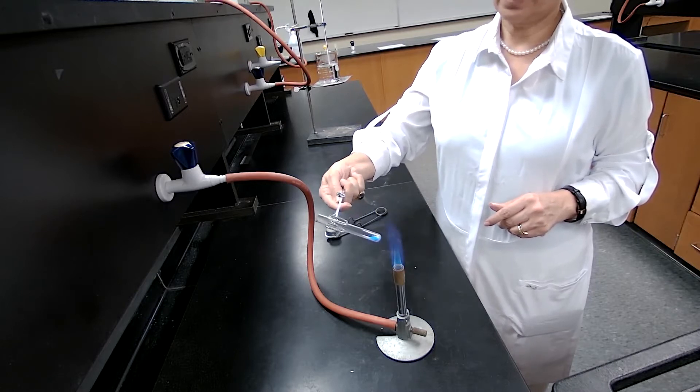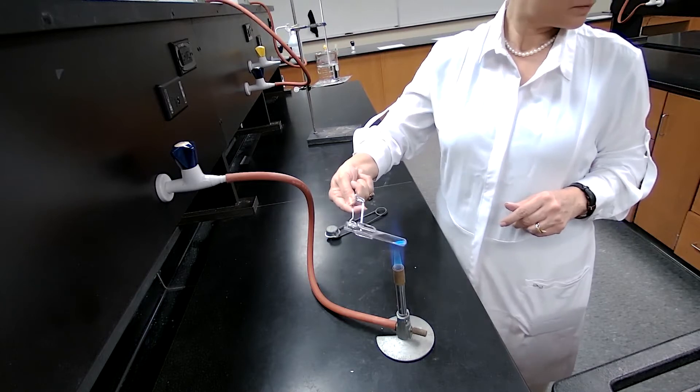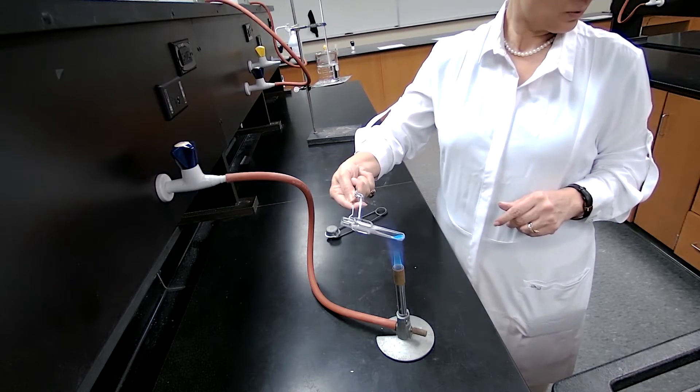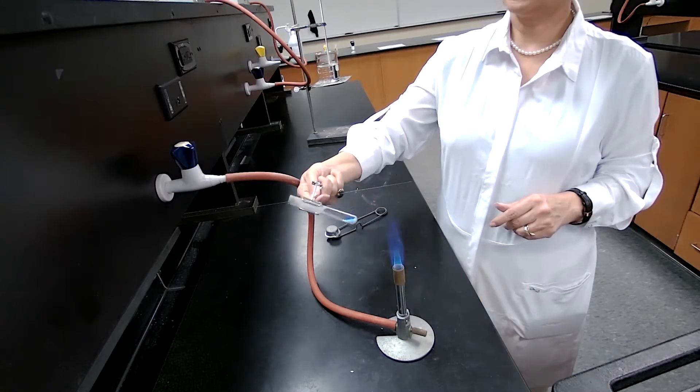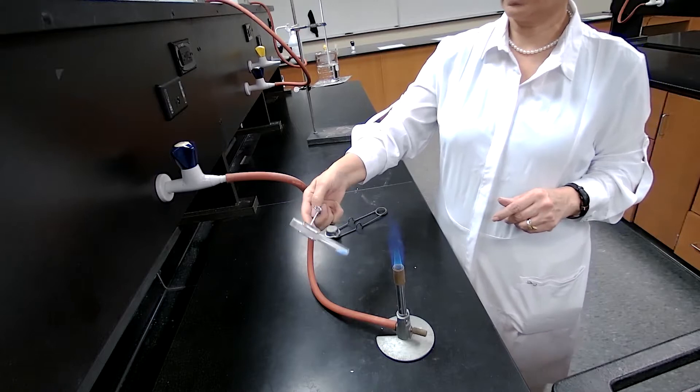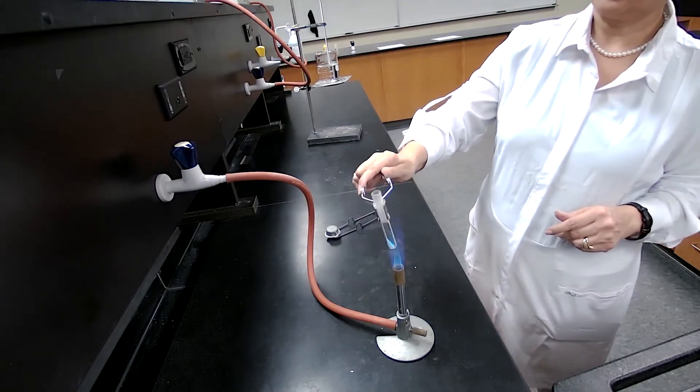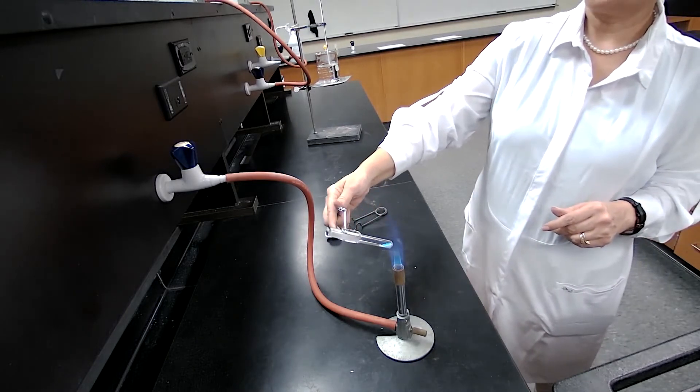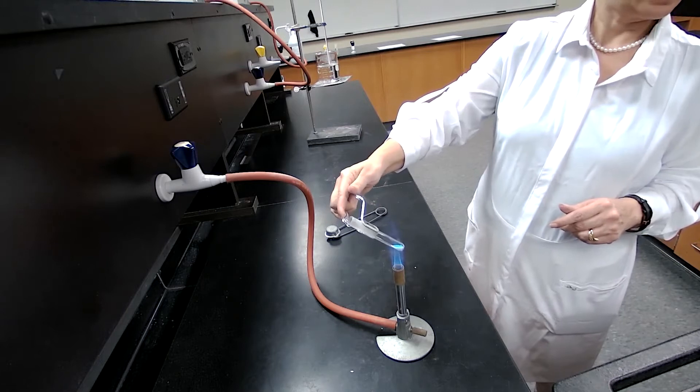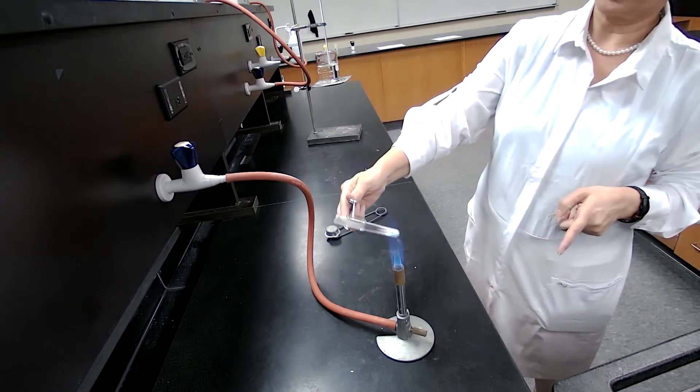For the purpose of experiment two, part three, we are heating the copper sulfate, hydrated copper sulfate, until it changes color. Basically it's going to lose the water of hydration. And as it loses the water of hydration, we see that water vapor is coming out of the end of the test tube.